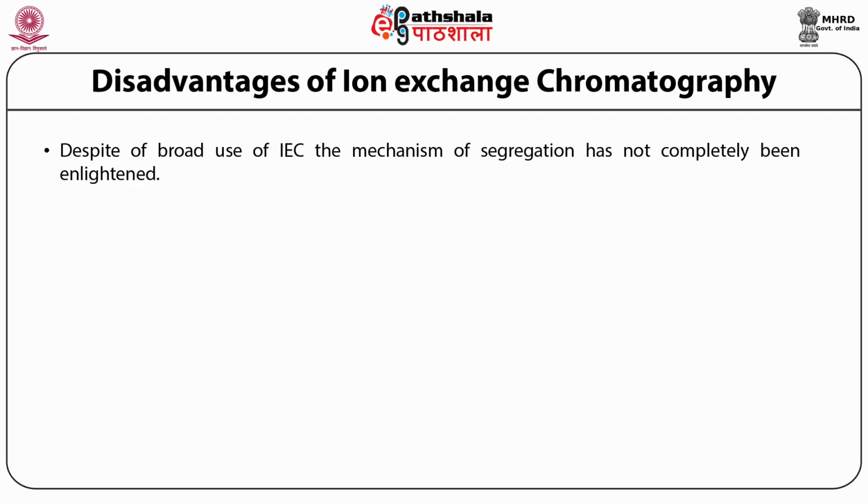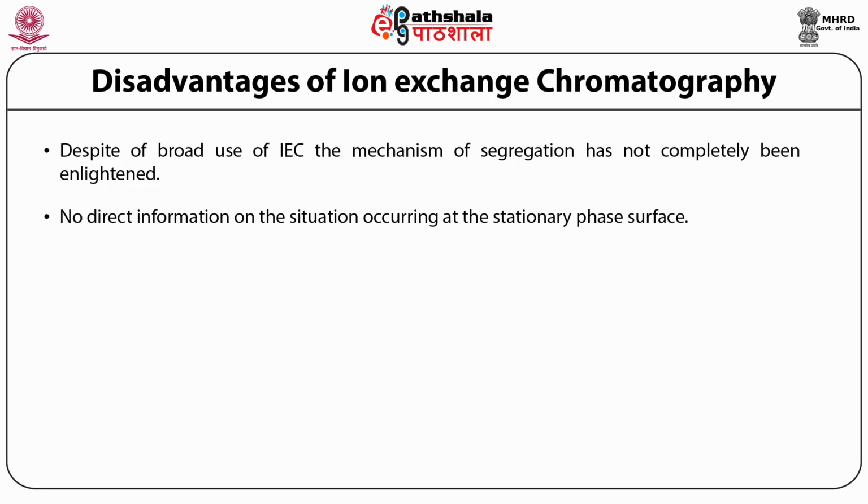One of the major disadvantages of IEC technique is that it presents no direct information on the situation occurring at the stationary phase surface, as the ion exchange equilibrium is always determined by the balance between the eluent and solute interaction with the active site resins.